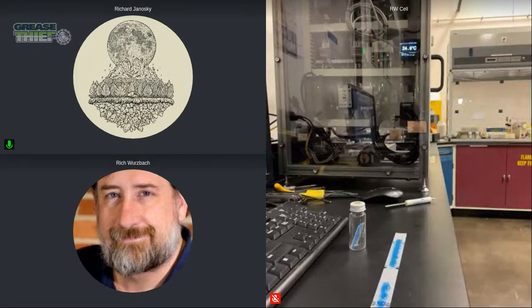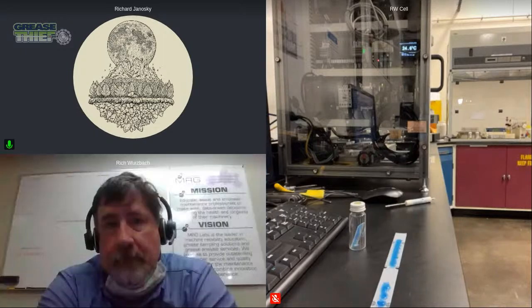I don't want to say it was Crackle, but it might have been something like that, where it's kind of gonna help to show, especially for in-service greases, which tests, as we keep mentioning, are repeatable and reproducible, and which ones are going to be able to be adding that high value to the customer. So it's not only are you getting a result, but are you getting a result that you're able to take value from and able to understand either, you know, what we're doing is good or we need to take action based on this.